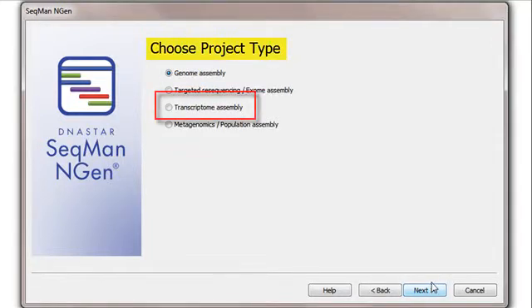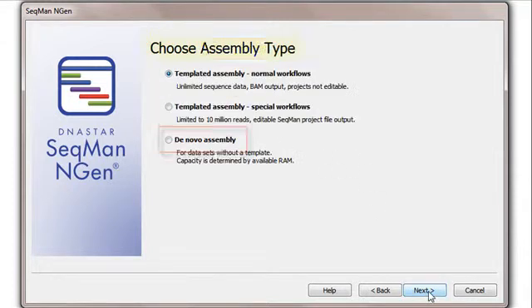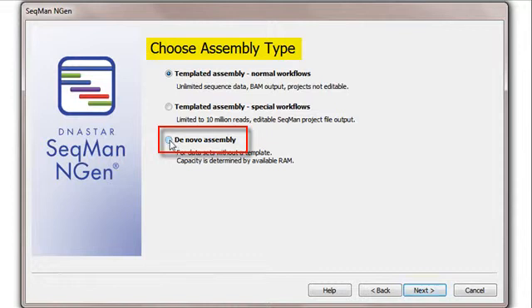Next I'll choose Transcriptome assembly as the project type, and de novo assembly as the assembly type.